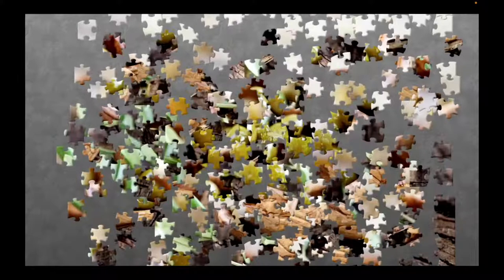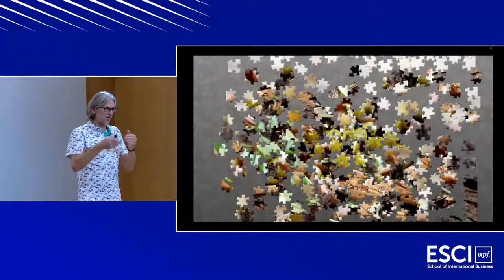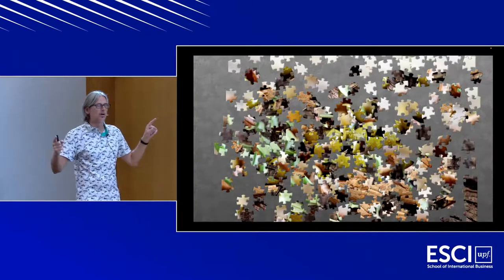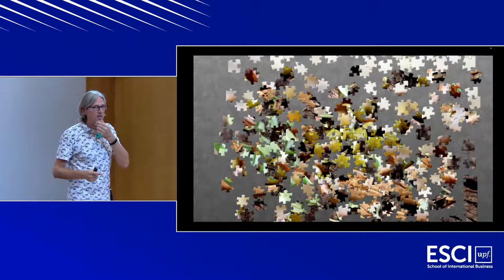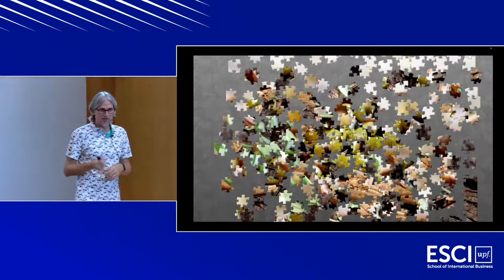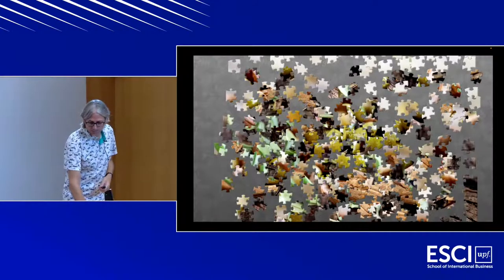Because we have some duplicated sequence, segmental duplications in the genome, which are terribly long, right? But with Oxford Nanopore, we can actually sequence across some of these. And with the hi-fi reads, because they're so accurate, even just a few variations in that sequence can help us resolve those segmental duplications. You know, they may be 99.9% identical, but still with the technology that we have now, it's becoming possible.